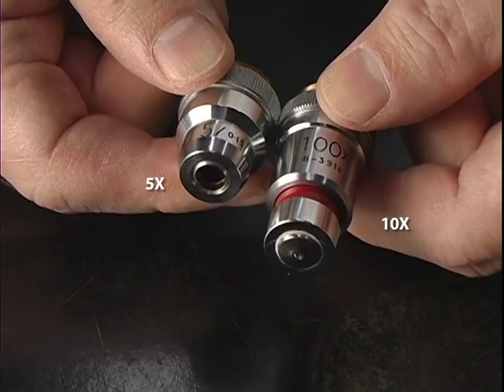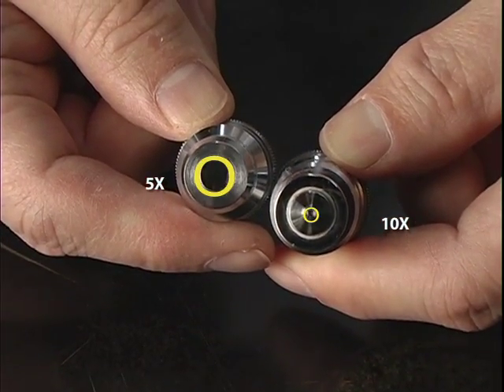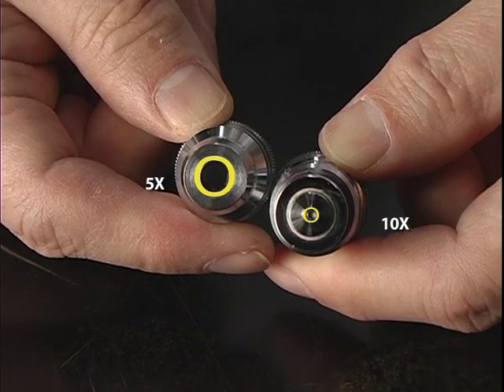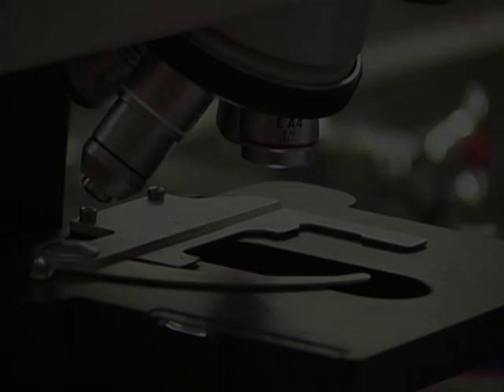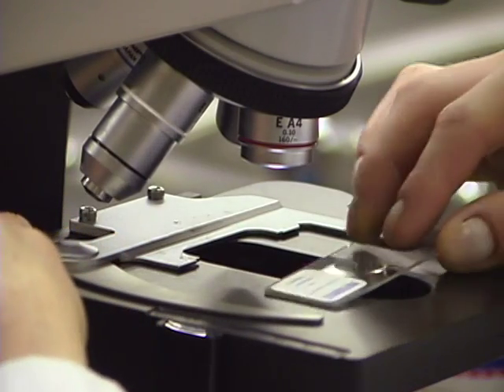Higher objective lenses have smaller diameters and so smaller fields of view. So, before changing from a lower to higher magnification, position the object that you want to see in the center of the field of view.